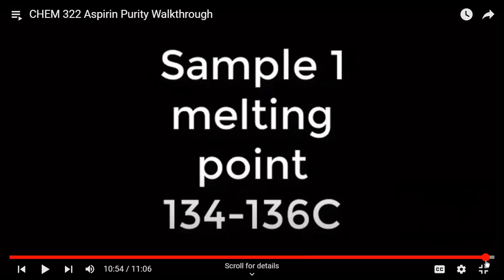And if you look at the melting point, it's also the one that's closest to the expected melting point, right? 134 to 136 is about as close as you're going to get to aspirin, which is 135. All right, any questions about anything else?